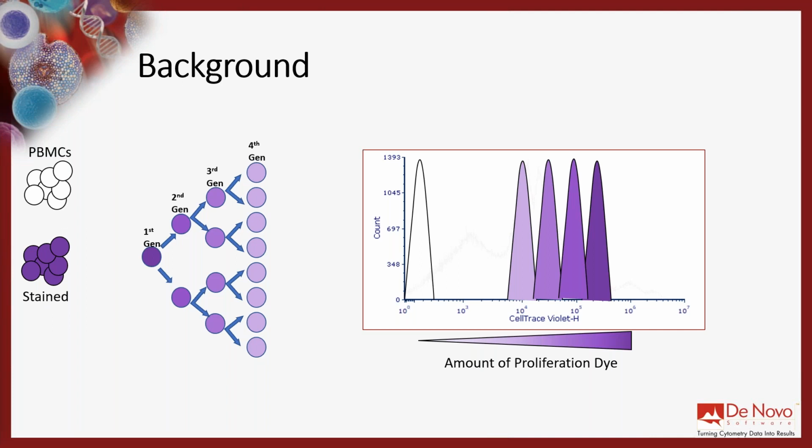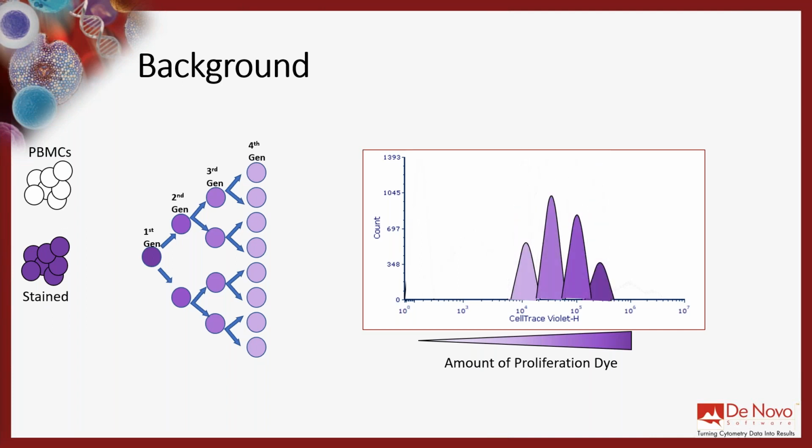Now, the reality is it's going to look more like this because there's a distribution of the populations that occur. And you hope that most of your cells have divided so you don't really have a negative showing, but you have that. And then you have the different peaks here, and then you can then determine what's going on. And then what you'll do is you can place different other antibody fluorochromes on there, and we'll talk a little bit about our example in a moment.